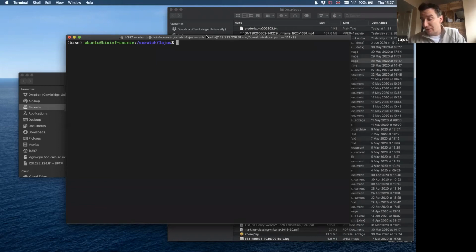But in many cases, you have more than just one sequence, and you want to look for your genes of interest in more than just one sequence.